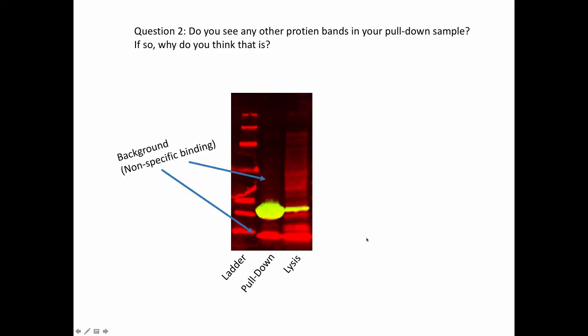You can see a large band down here and you can see some faint bands up here—we call this background. What we mean by background is just proteins that bind non-specifically to the agarose beads. If you do see proteins in your pull-down sample that are red but they are not green, that tells you that these are background bands and they non-specifically bound to the agarose and that's why you see that.